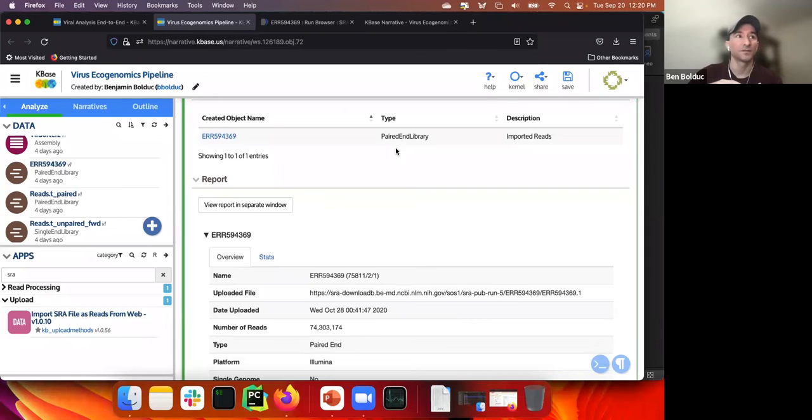However, if you wanted to run VirSorter, that can't use paired end libraries because it doesn't make sense to be predicting virus sequences on those raw reads. Of course, there are tools out there that classify stuff, but that's beside the point. The point is that VirSorter isn't designed to use reads as an input. As the developer, I only have certain inputs that VirSorter can use. Paired end libraries aren't one of them.